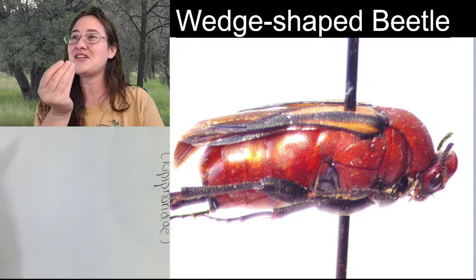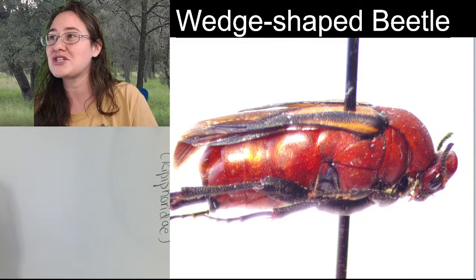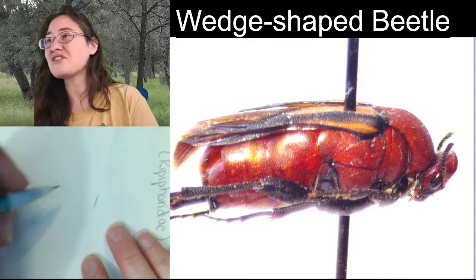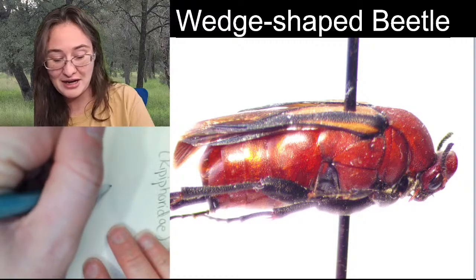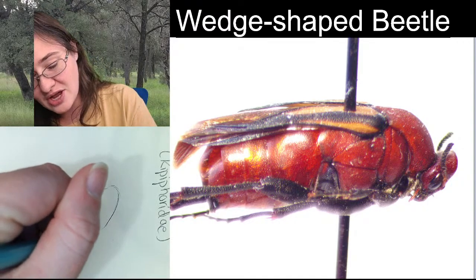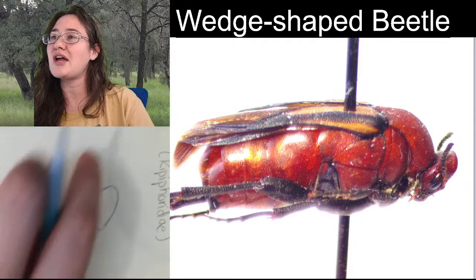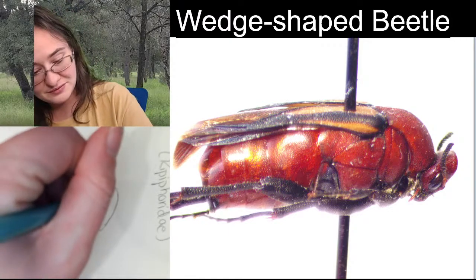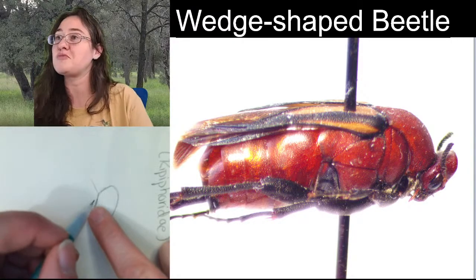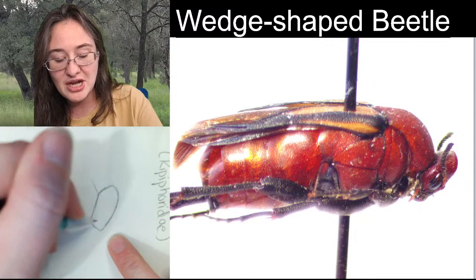And funny enough, it's all on a very similar plane, so we shouldn't have to focus the microscope up and down too much. You'll notice that the head looks kind of small in comparison to the rest of the body and is pointing kind of down. So I'm going to give myself the overall shape of this head, which I'm going to start kind of like a slanted oval. I did give myself where I imagined the connection of the pronotum here and then the crest of the head.